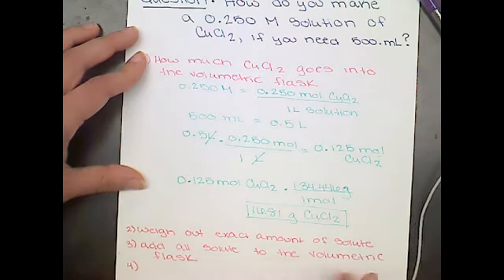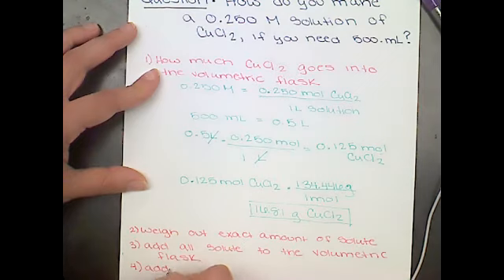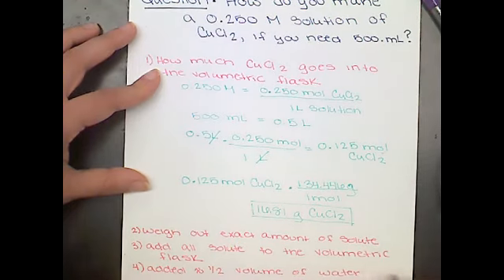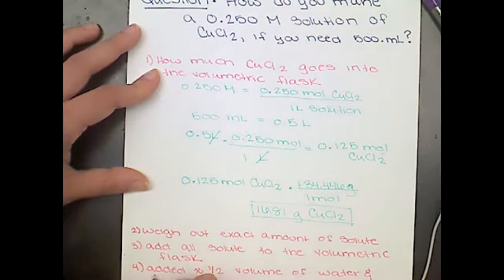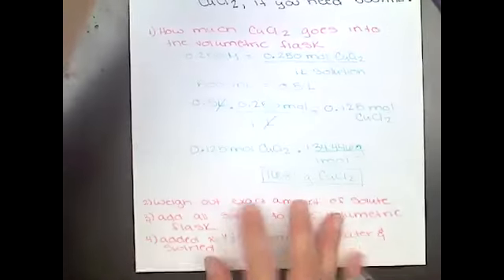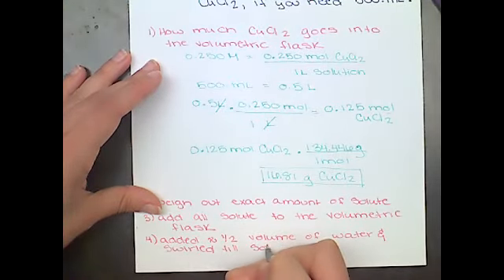The next step that I did is I added approximately half the volume of water and swirled, let me move this up, till solute dissolved.